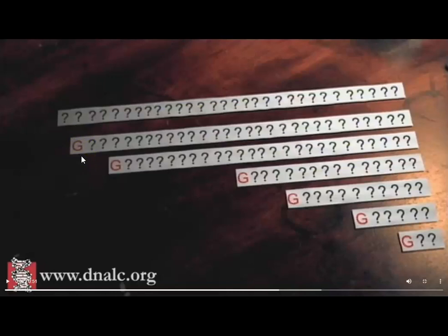Is it clear? So let's say the replication process, the copying from the original template or original DNA, is starting, and then whenever it reaches a G, the replication will be stopped.